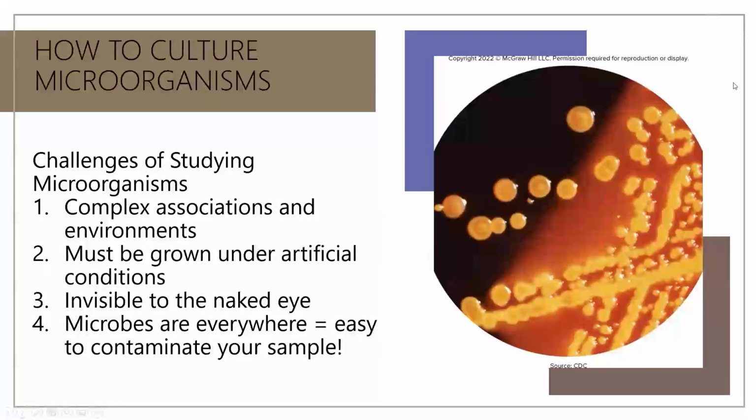So our first section is on how to culture microorganisms. And while this may seem easy, considering microbes are everywhere, we learned last time that they're ubiquitous, found everywhere, trying to get the one you want to grow is the challenge. There's a couple others that we need to think about.